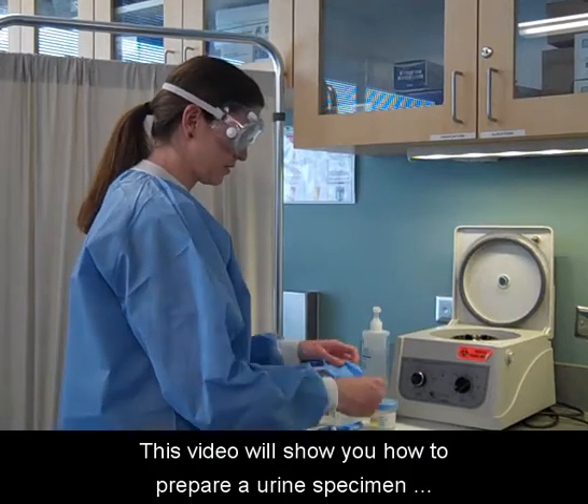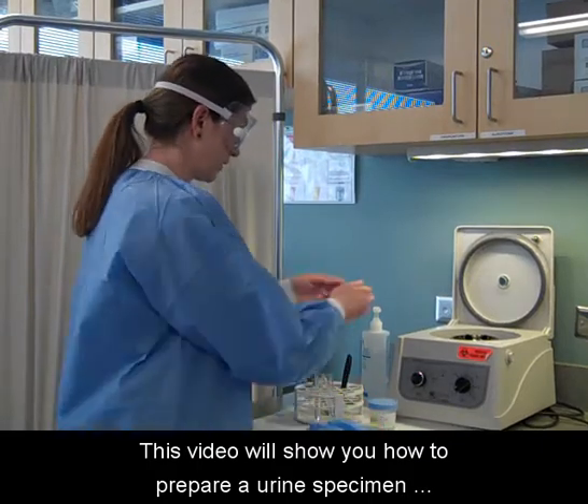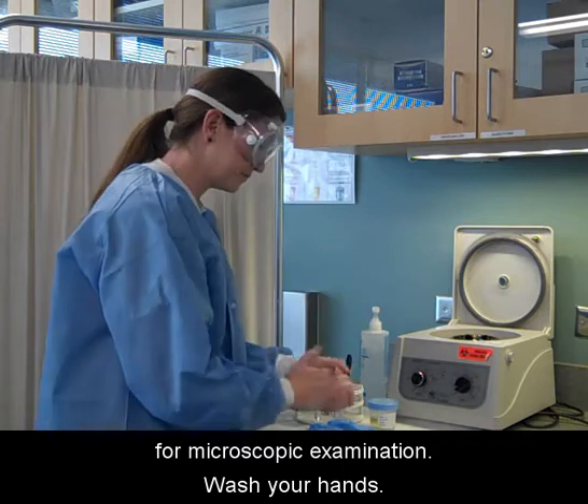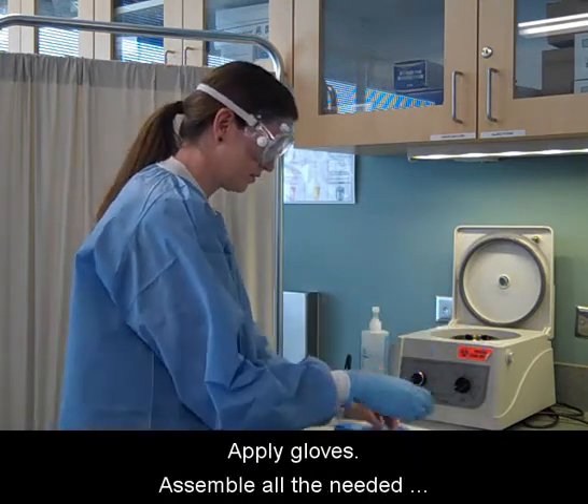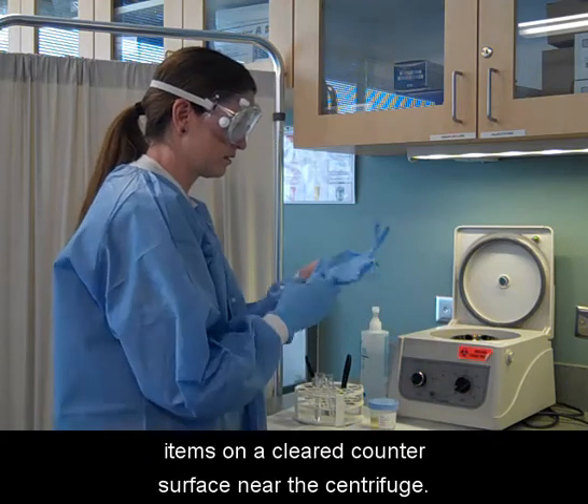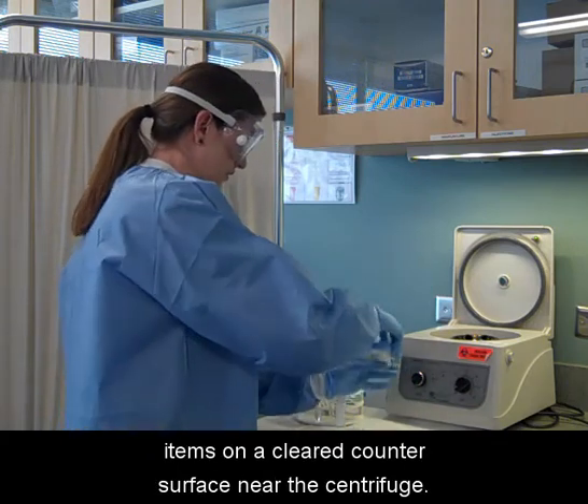This video will show you how to prepare a urine specimen for microscopic examination. Wash your hands and apply gloves. Assemble all the needed items on a cleared counter surface near the centrifuge.